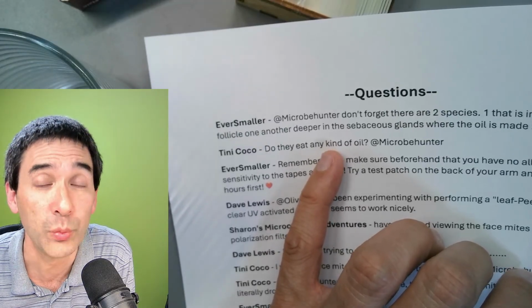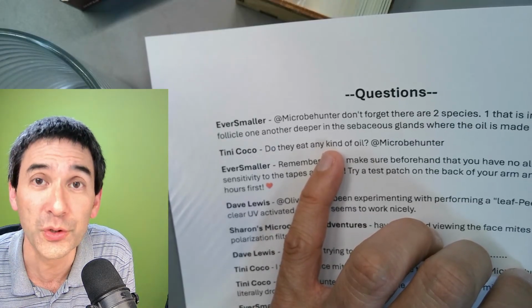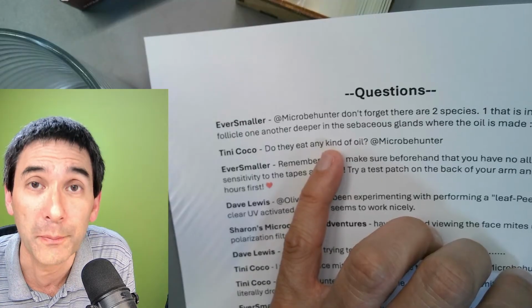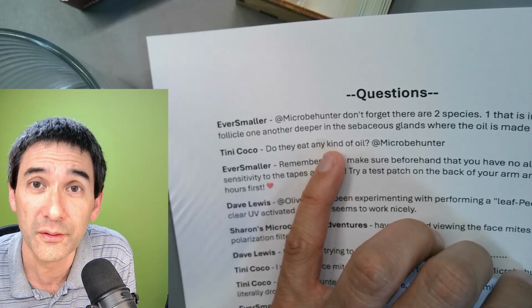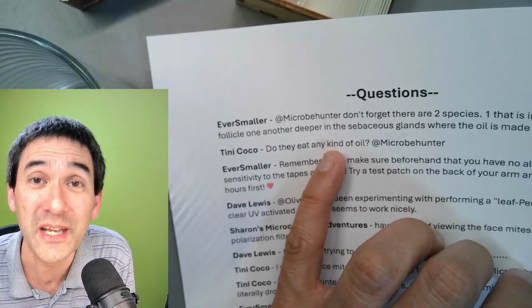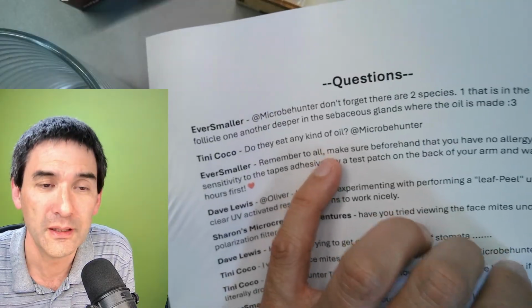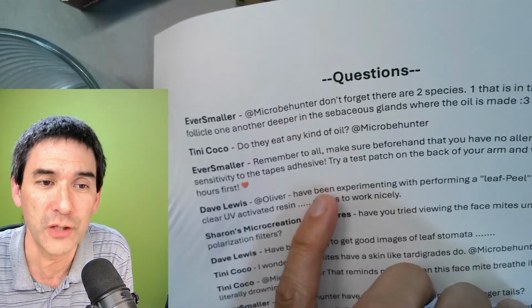Because I tried it once with water, and basically I was not able to pick them up that way, because the face mite being hydrophobic, being fatty, did not really like to stay in the water, and then I had a problem picking it up. Okay, yeah, it's the tape allergy that we talked about.